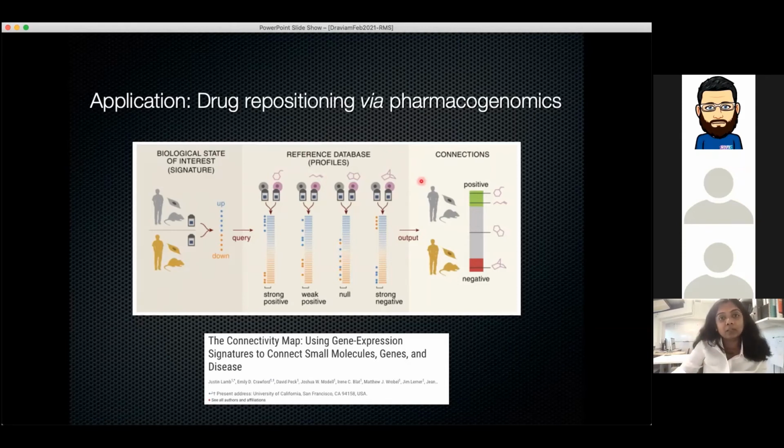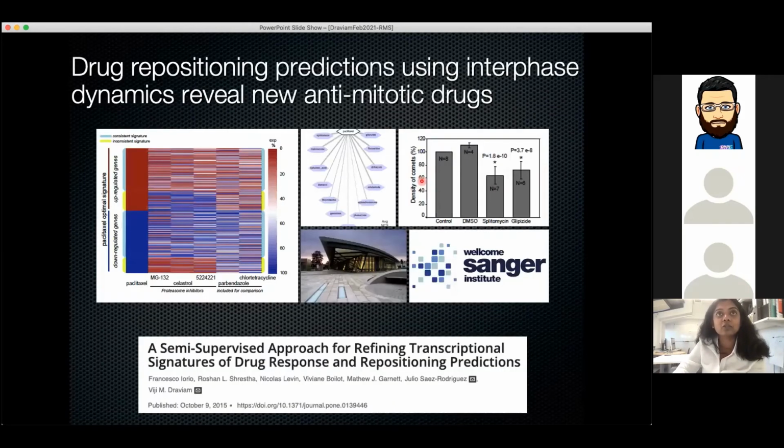Once we had a bunch of drugs of that kind, we wanted to just throw them on cells and watch microtubule behavior. So you can imagine now you will have hundreds of drugs at hundreds of different dilutions and combinations. You want to apply them to your cells and track microtubule behavior. Now this problem cannot be manually parsed. That's where you need automated tools for microtubule end tracking.